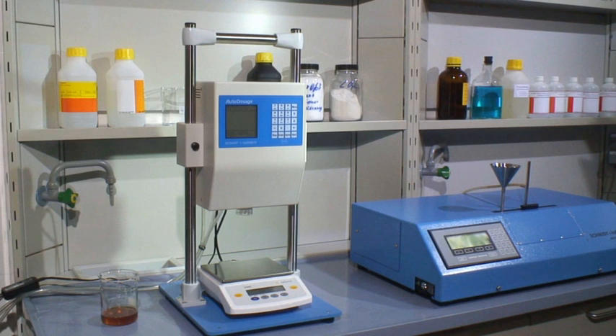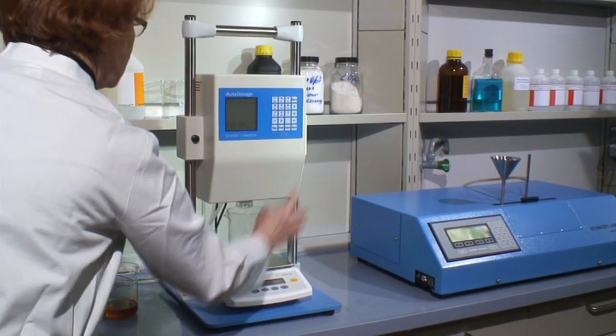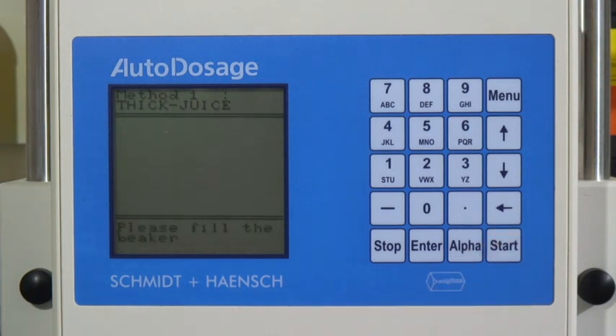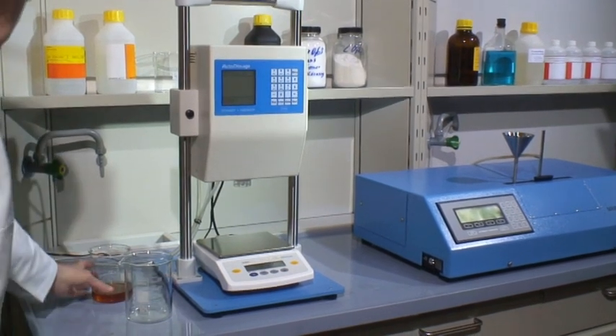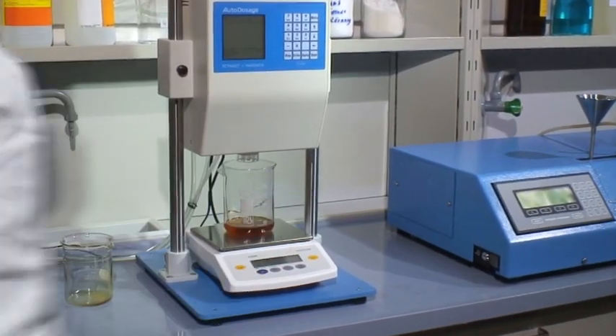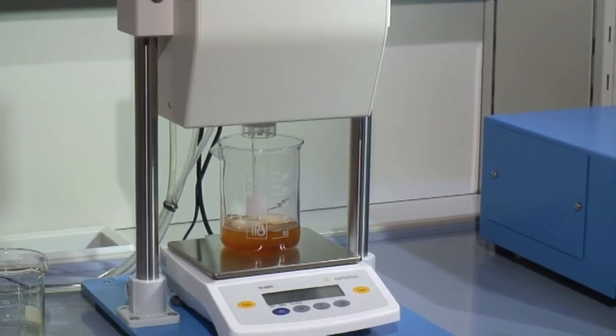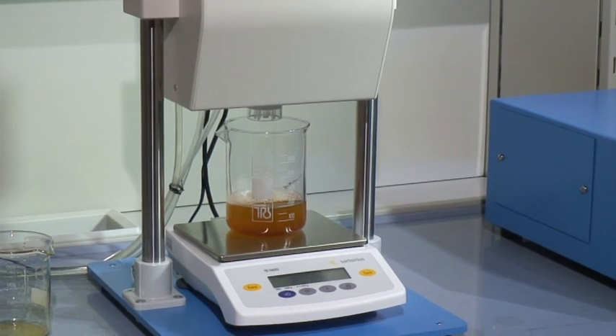In case the 26 grams method is used, our universal dosage system, Auto-dosage, is a great help. The Auto-dosage is a proportional balance and allows for quick and comfortable sample preparation when either a well-defined weight per weight or a weight per volume dilution is needed. For instance, the 26 grams per 100 millilitres preparation and the 1.5 ratio addition of clarifying agent is already pre-programmed. A beaker is placed on the balance and the system is set to zero. The system allows you to program up to 70 different dosage recipes. It is not necessary to weigh exactly 26 grams — the system allows a tolerance of the first part of the formulation. Auto-dosage will automatically correct the difference according to the predetermined values and dose either less or more solution to obtain the identical ratio of the composition.